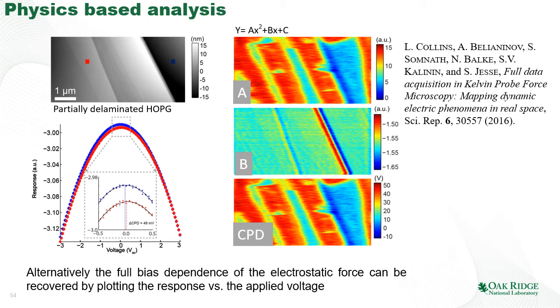So this is just a surface bias. The second quadratic component gives us the capacitance, and we see this classical picture of the positive negative feature of the step edges. This is just a topographic crosstalk. And the vertical offset gives us also something that we don't quite understand.